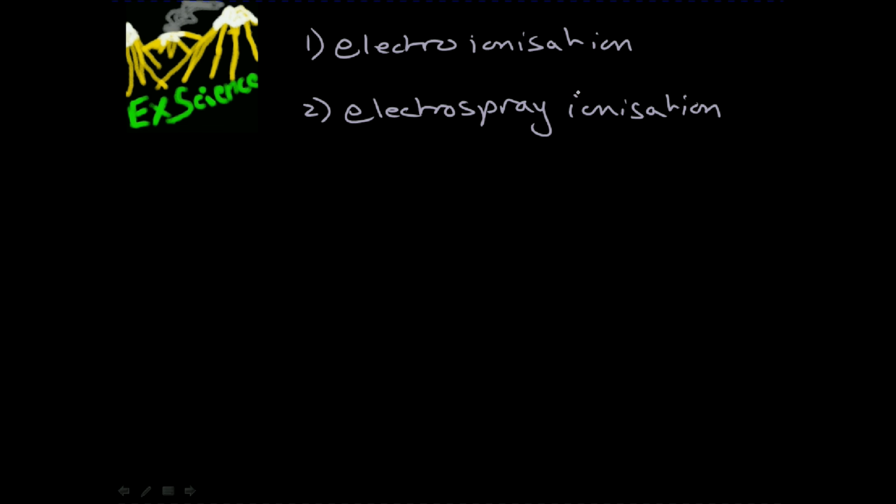In electron ionization, the sample must first be evaporated. That is conversion from a liquid or solid into a gas. It is injected at a high temperature into the ionization chamber, which is under a very high vacuum. The gaseous particles are then bombarded with a beam of high energy electrons from an electron gun. This process knocks electrons off some of the particles, generating ions. This suits small, volatile, and ideally fairly robust small molecules and atomic materials.